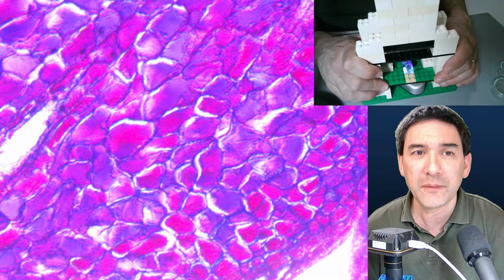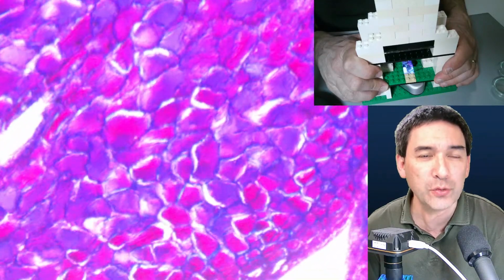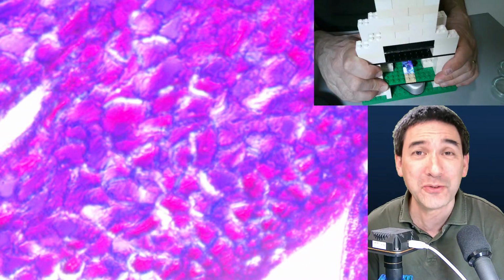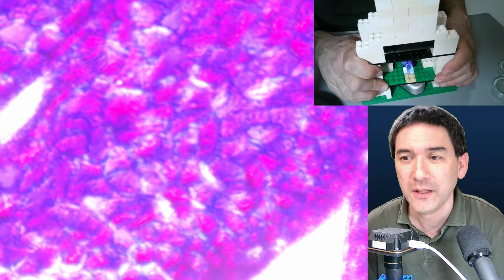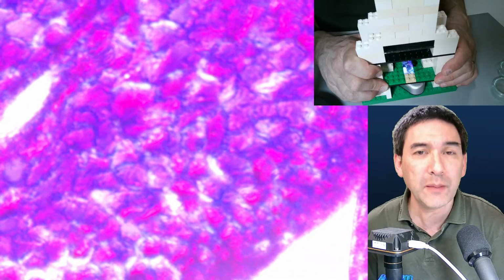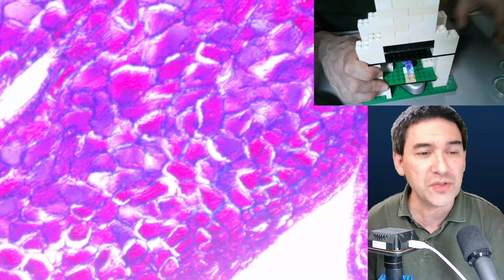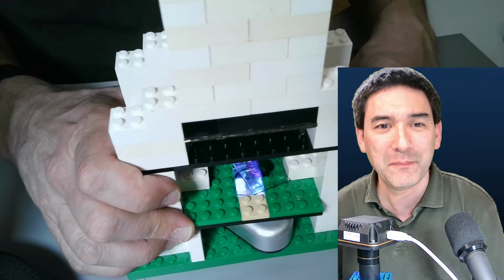Now the image does not appear to be very high in contrast. But actually, if you use eyepieces, then you have very good image quality. What I'm going to do now is quickly show it to you. So this is the image that you see, but I also prepared a slightly bigger view here.